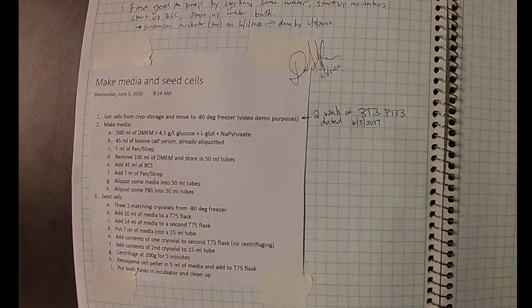And so in this case, since I already typed it out, I just printed that out and taped it into the lab notebook. You can see I hand wrote the results in here. And so you have to really think about what kind of lab notebook you want to take, especially when you're working with a biological lab.